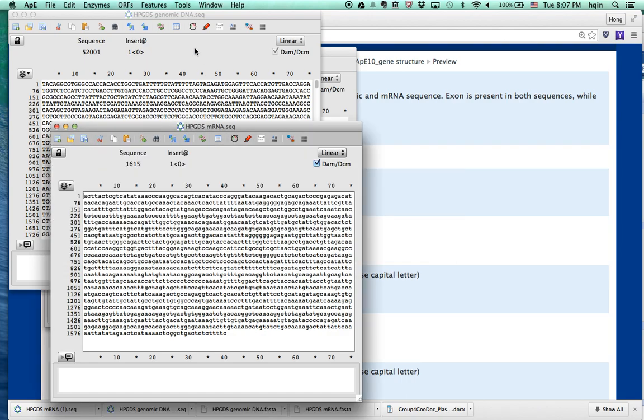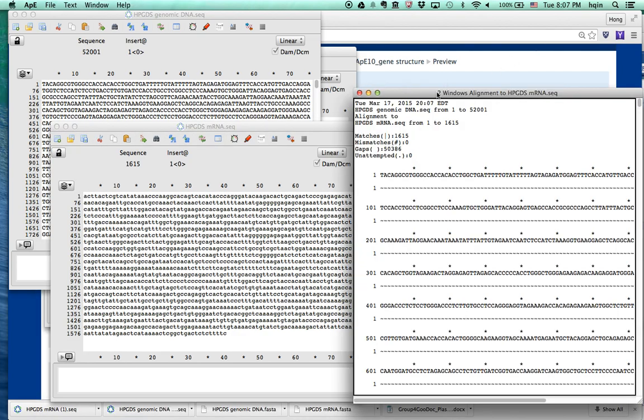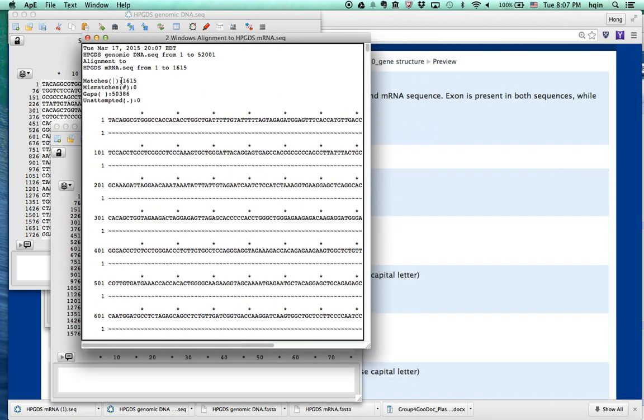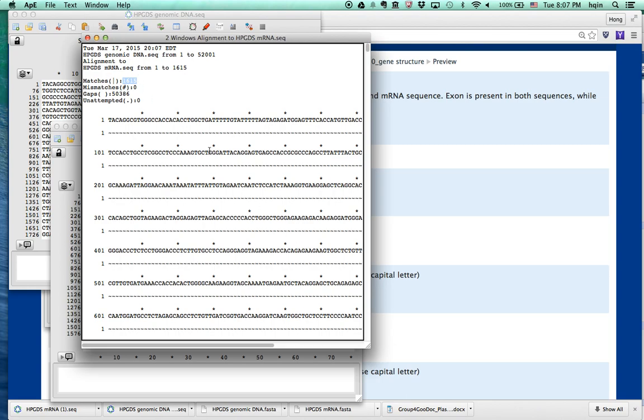Okay, I hope it's running. So here's the alignment. Genomic DNA is 1 to 52,000 something. mRNA is from 1 to 1615. The total match is 1615. The mRNA is matched to the genomic DNA. There are also many gaps. There are many gaps, 50,000 gaps. So there's no mismatch.